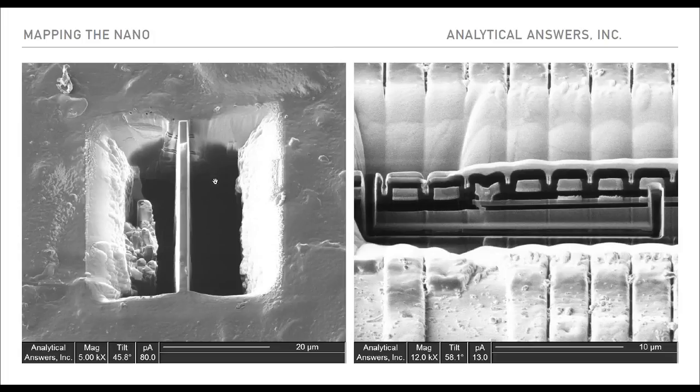Seen from the side, here we can see that we have the two holes that we've dug out to free out the cross-section. And then on the right, you can see that the little tiny sliver of material, which is about 20 microns long at this point, and it's only about a micron thick, you can see that it's been undercut on three sides. You can also see the structure of interest, that contact right near the middle of the screen where the metal line is connecting to that buried metal line. That's going to be our target for the STEM analysis later.